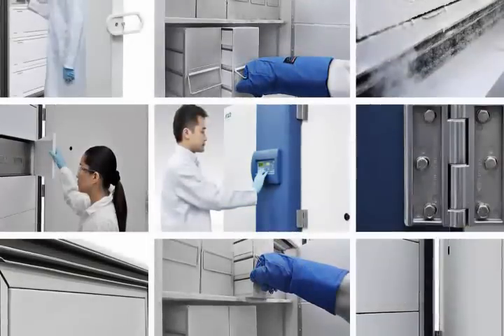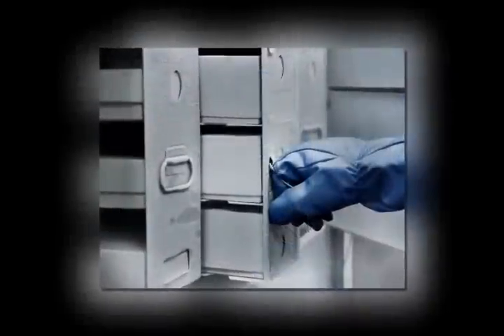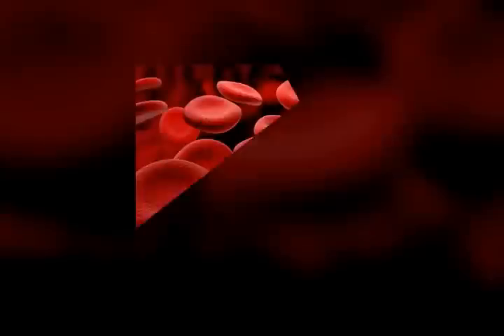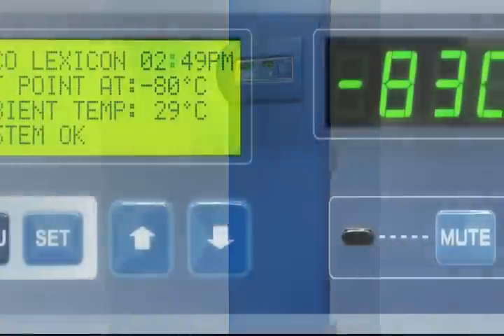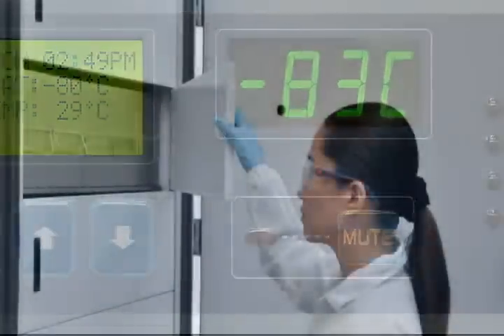ULT temperature freezers are widely used in scientific research for long-term storage of temperature-sensitive biological samples, such as red cell samples and blood plasma. As ULT freezers are often operated at minus 80 degrees Celsius continuously for years, reliability is of paramount importance to researchers.